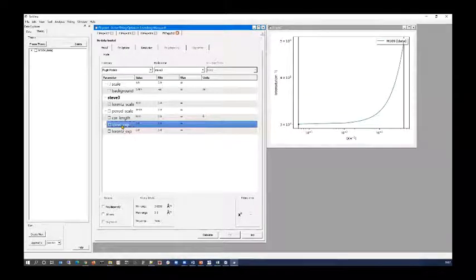So if you can find an existing model which is close to what you want, you may be able to edit it a little bit. If you can't, if you've suddenly found some wonderful equation in a paper somewhere that you want coded up and you can't code it, I'm afraid you're going to have to find yourself a Python person. Whilst the development team would love to do it for you, we simply don't have the resources. So that's finding models.